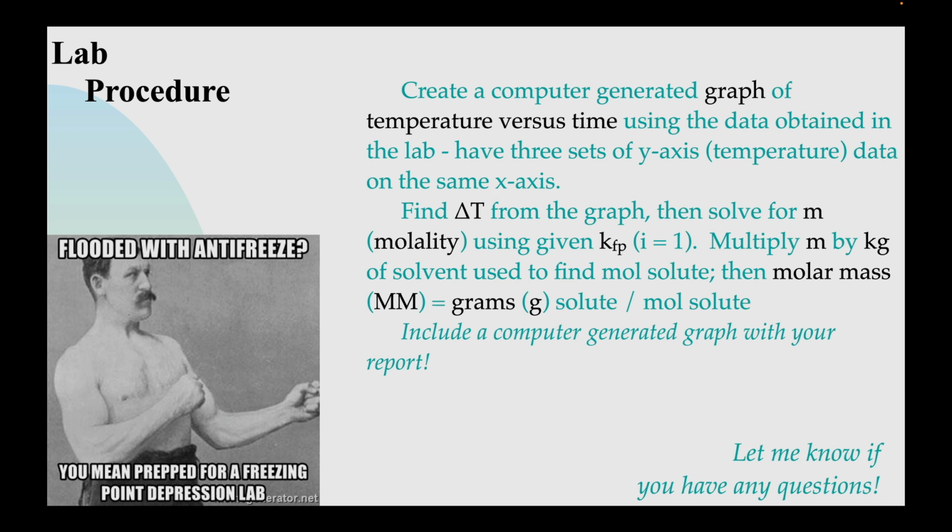You do want to include a computer-generated graph with your report. Make sure you get rid of any of that dead space. You want to see your data up close, and make your graph a full page. All right, don't make it small. You want to have a big graph so you can see it easily. If you have any questions, of course, please let me know. The Learning Success Center / Avid Center can help with this kind of material as well. It should be pretty mellow.